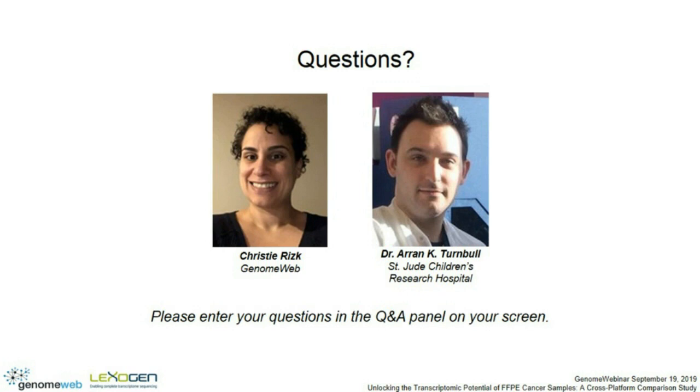It seems like the goal has long been to get good quality data from FFPE samples, and you talked about some of the ways that can be done. But is there a better way to preserve tissue, or is freezing the only alternative? Again, that's a very interesting question. I think, to be honest, especially in a clinical environment, it's quite difficult to logistically introduce something that's not done as standard. The advantage of FFPE is, of course, that these tissues are collected and processed through routine pathology labs and are therefore stored as part of the normal healthcare process.